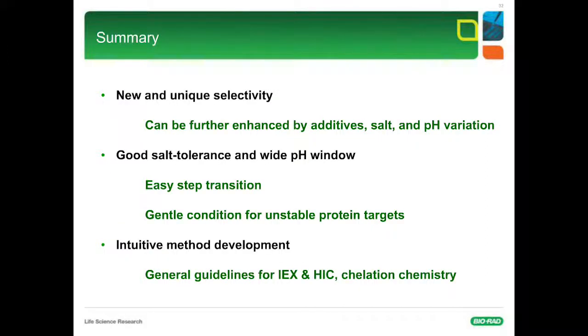So here is a brief summary of my talk. I've shown you the new and unique selectivity for mixed mode chromatography. This kind of selectivity can be further enhanced by the use of additives and by the variation of buffer salt concentration and pH. Also, for mixed mode chromatography, we often see they all have good salt tolerance and a wide pH window for separation, which will allow you to do easy step transition between chromatography steps and other purification steps. And you can also choose a condition that's gentle for protecting the activity of your target protein.